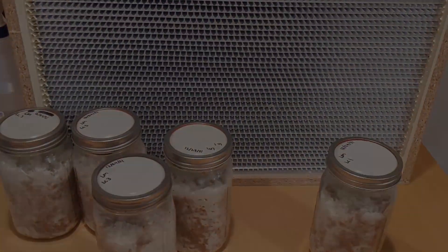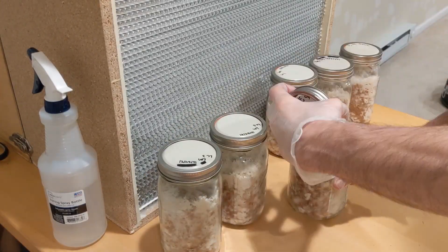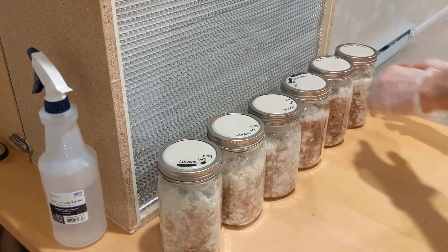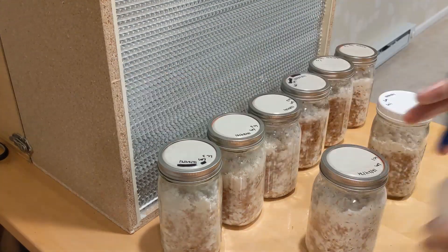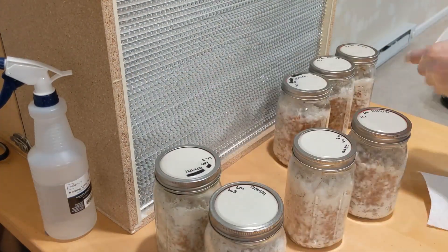I'm going to do a time-lapse or something — catch you in a sec. Welcome to the time-lapse. I went ahead and checked over my cultures again just to double-check what I wanted, and as you can tell from the finger pointing on the screen, I went with three.